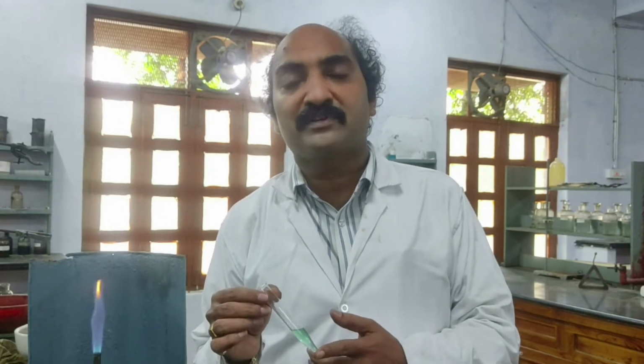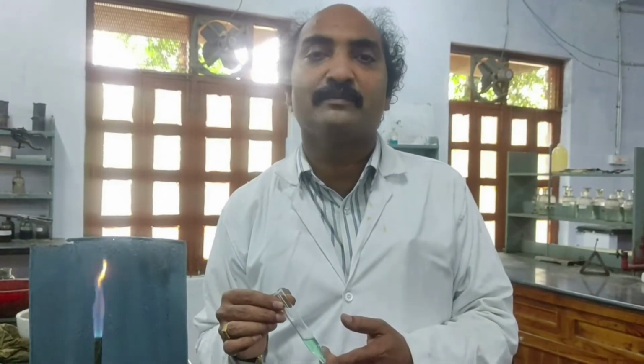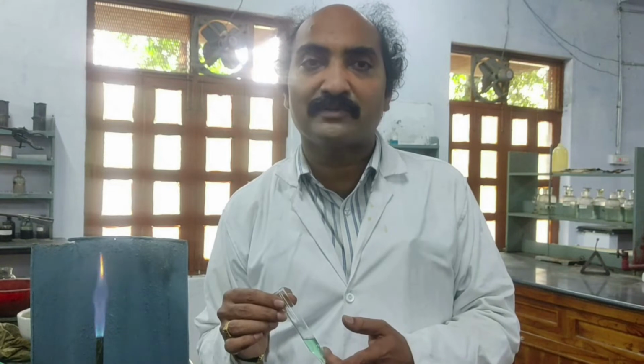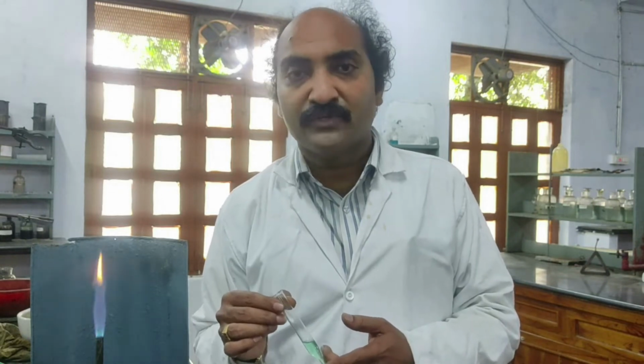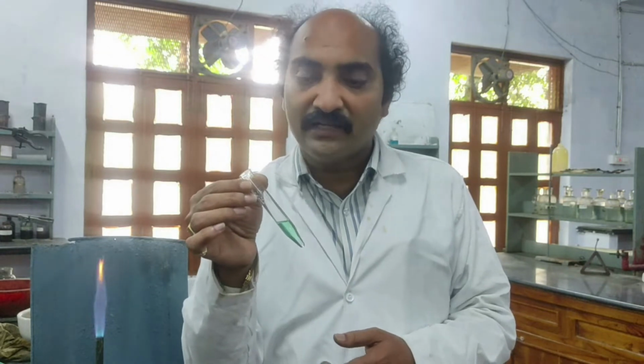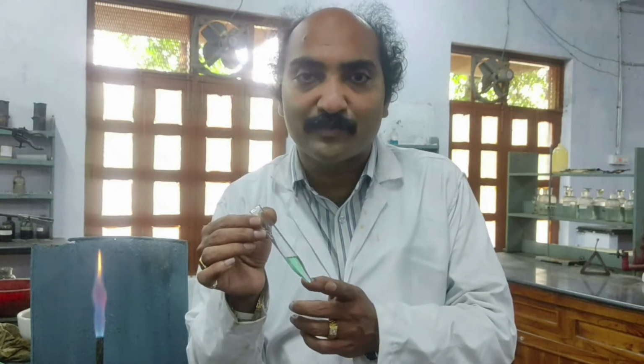In this session, we are going to explore the fourth group separation table. So what are fourth group cations? As per the present aptitude syllabus, we have nickel plus 2, Zn plus 2 and Mn plus 2 cations in fourth group. So this is the solution that is supplied to me by the lab attendant. I need to explore the fourth group cations present in this.